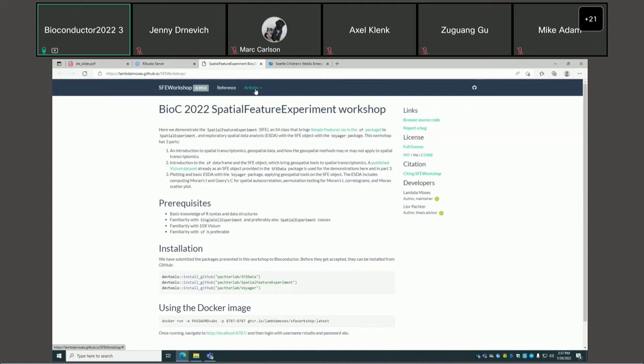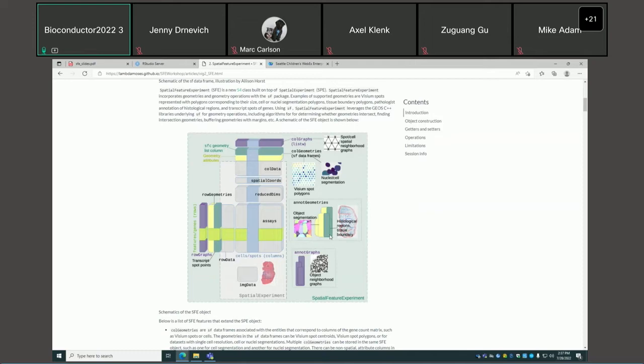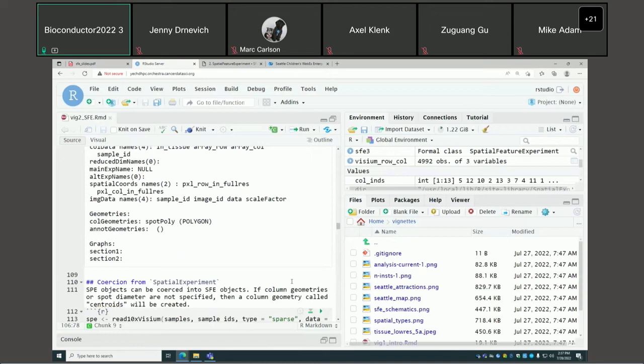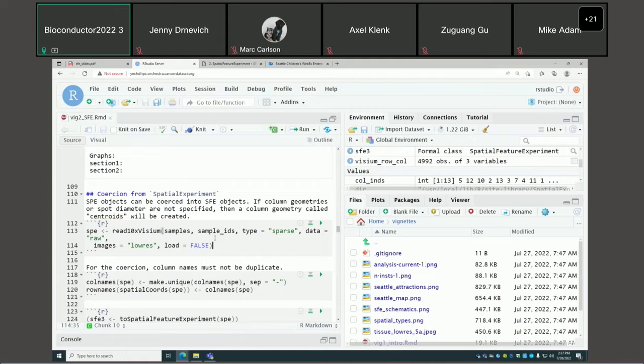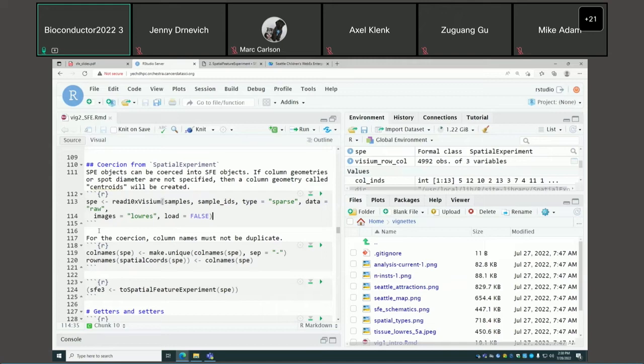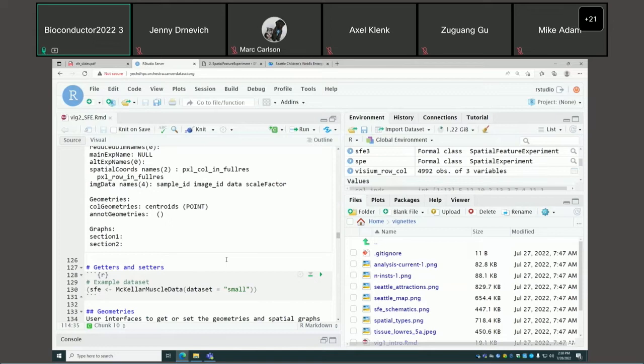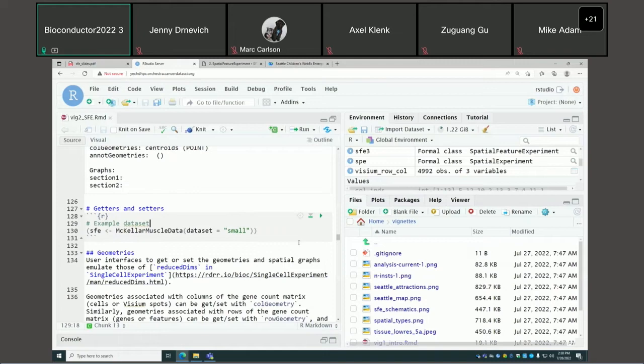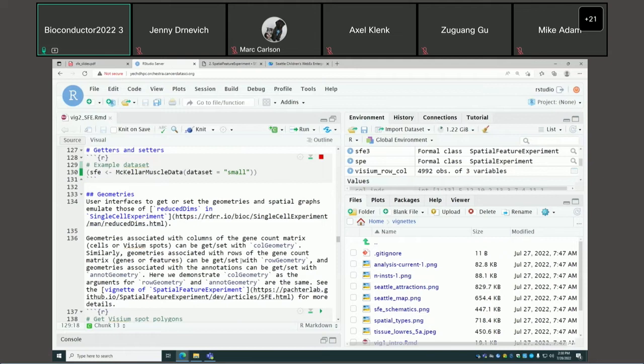The notebook is knitted and available on the workshop website from the workshops tab. I'm just running the code here in RStudio. If you already have an SPE object, you can convert it to an SFE object, but the caveat is that duplicate columns are not allowed. We'll use a small subset of a real dataset to demonstrate how you interact with the object and get and set different fields.